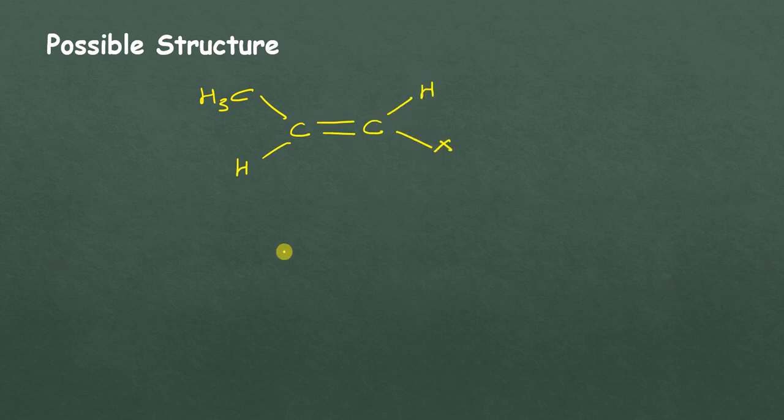So we'll write the structure here. I have a CH3, H double bond C, one more H and some substituent present. In the other case, we have derived O CH2 CH3 from peaks A and C in the H1 NMR. We have derived this fragment, and from IR it also contains a carbonyl group, which is most possibly a conjugated ester, right?